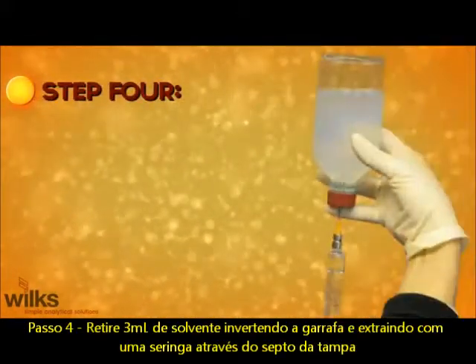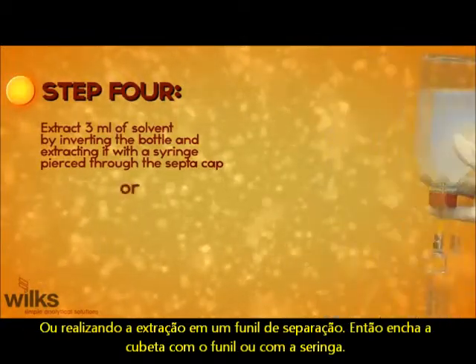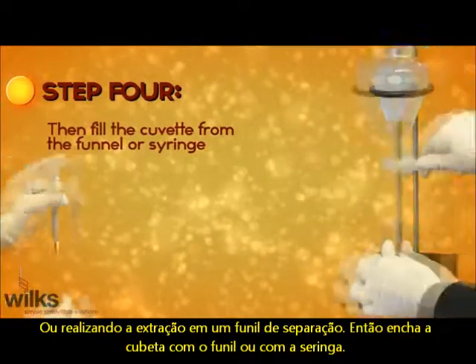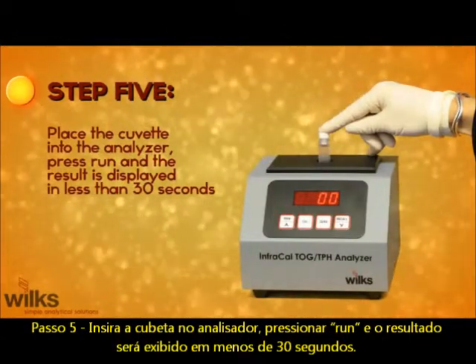Step 4: Extract 3 milliliters of solvent, either by inverting the bottle and extracting it with a syringe pierced through the septic cap, or pour into a separatory funnel. Fill the cuvette from the funnel or syringe. Step 5: Place the cuvette into the analyzer, press run, and the result is displayed in less than 30 seconds.